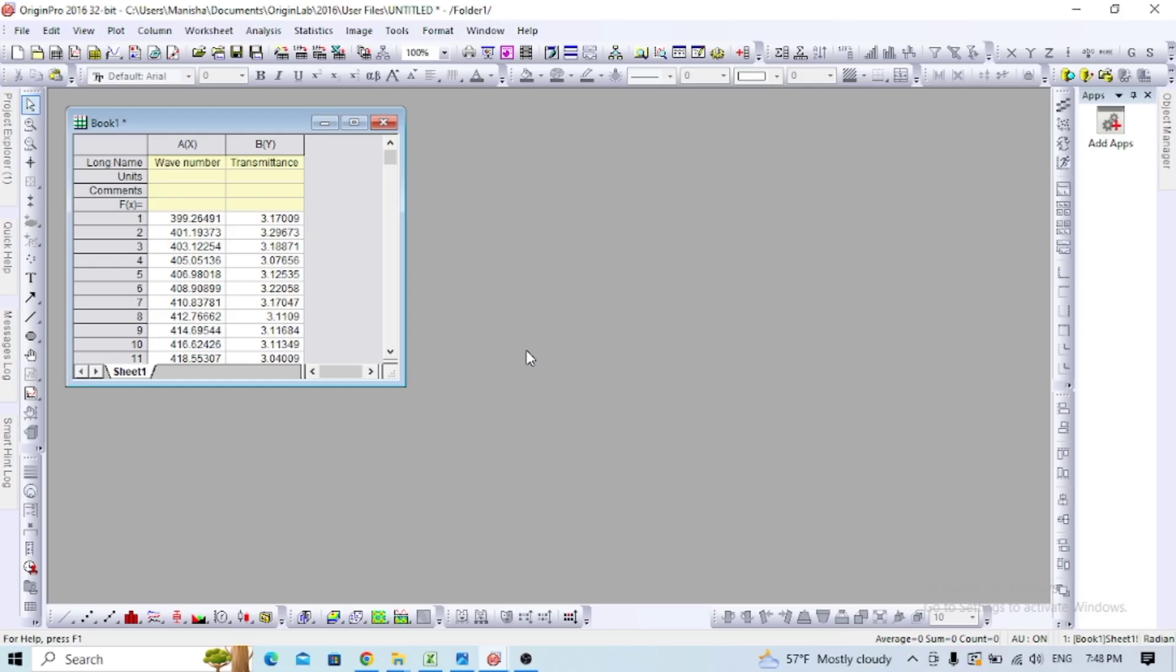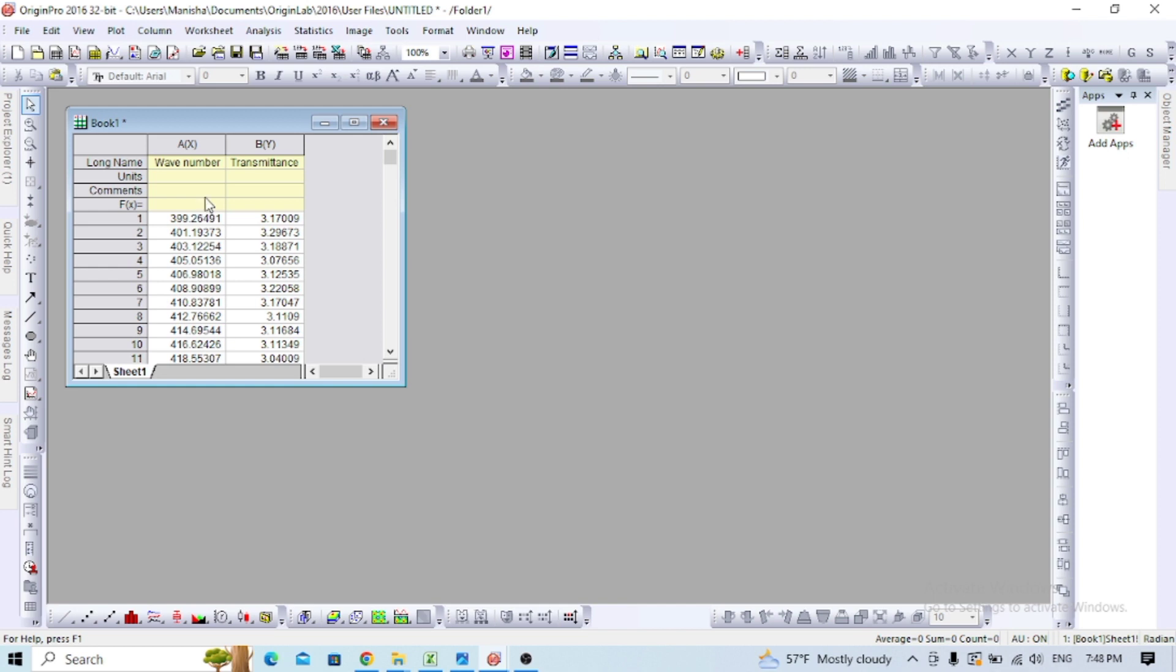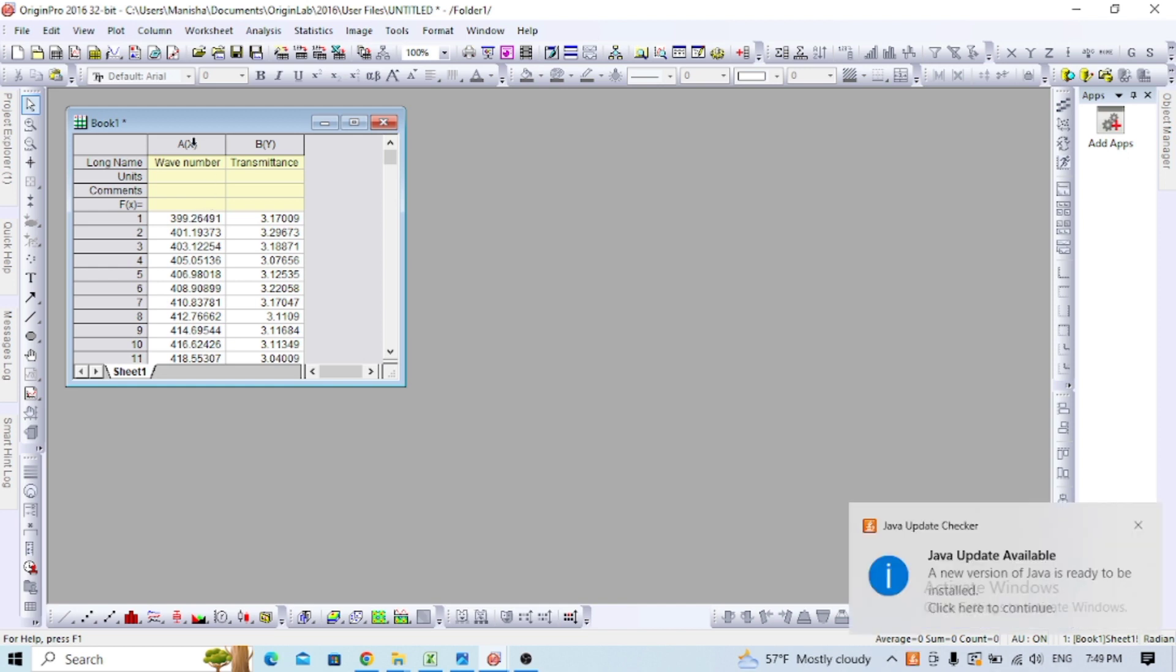Today I'm going to show different data analysis on Origin software. We'll work with FTIR data which needs smoothing and presentation. I'm here to show how to perform smoothing and baseline correction of FTIR data.